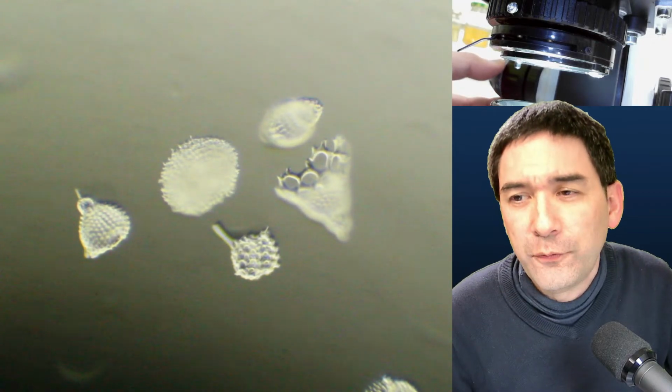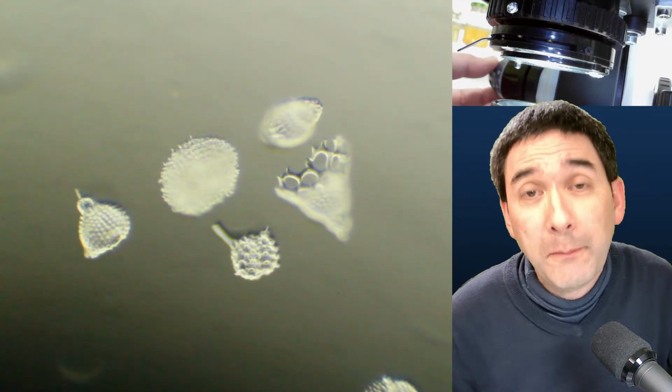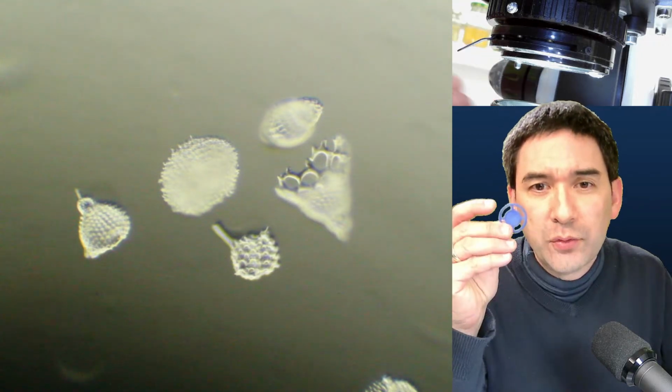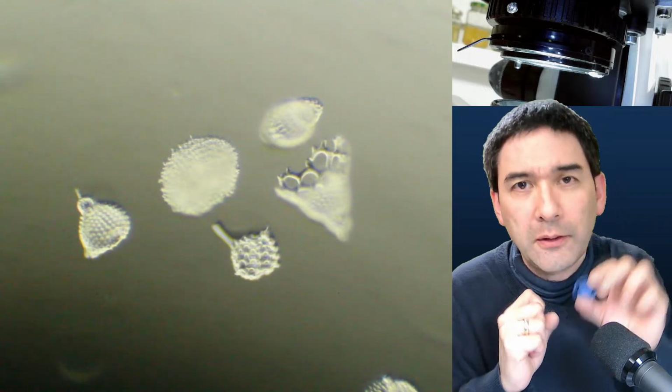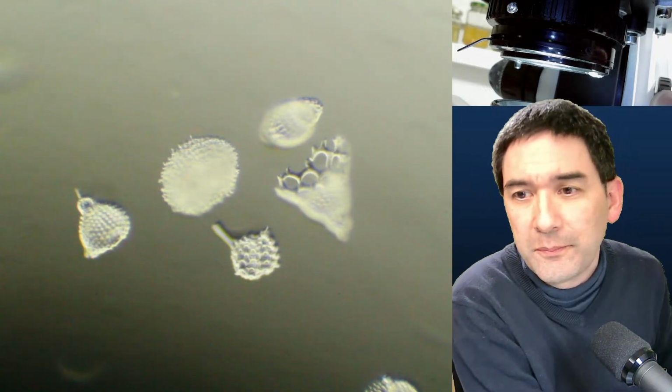So unfortunately, I do not have any experience with that, but I'm quite sure that it would work. But the really important thing when using those filters is you have to really make sure that the size of the central disc is correct. And probably one of the easier ways to figure that out is by trial and error. Okay.